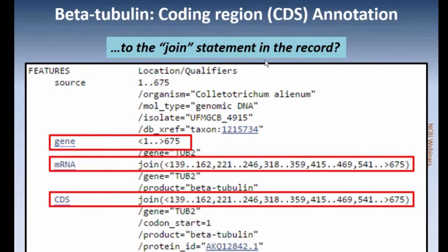In the display record, you'll see the word join, the parenthesis, and then the groups of nucleotide numbers. Recognize that this is only in the display format. When you define the nucleotide numbers, you will do that in the feature table without the word join, and we will show that a little bit later in the video.